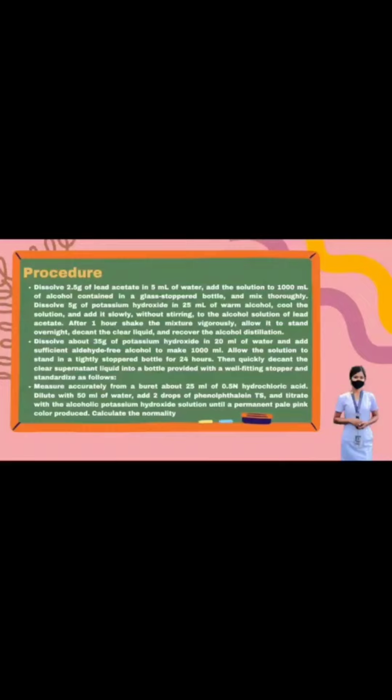The potassium hydroxide converts any acids present into non-volatile salts and causes the polymerization of aldehydes. The lead acetate is decomposed by the potassium hydroxide with the formation of lead oxide and potassium acetate. The lead forms insoluble and non-volatile compounds with any sulfur compounds present. The lead oxide carries down the polymerized aldehydes when it is precipitated, so it is easy to decant the clear supernatant liquid.